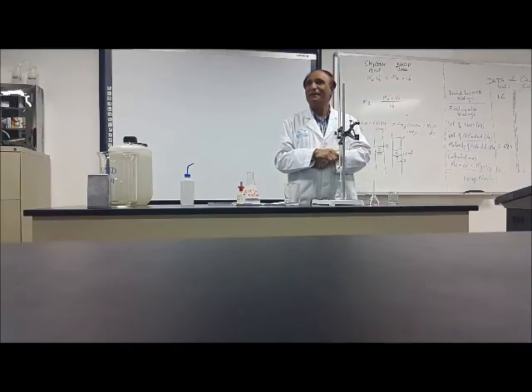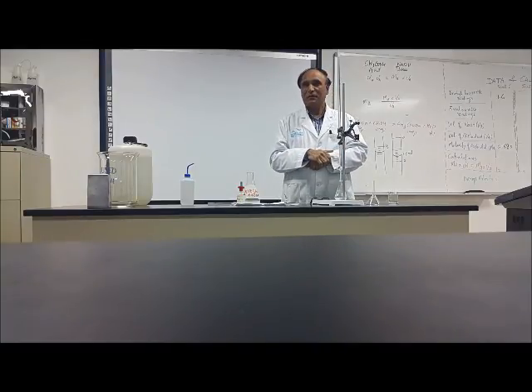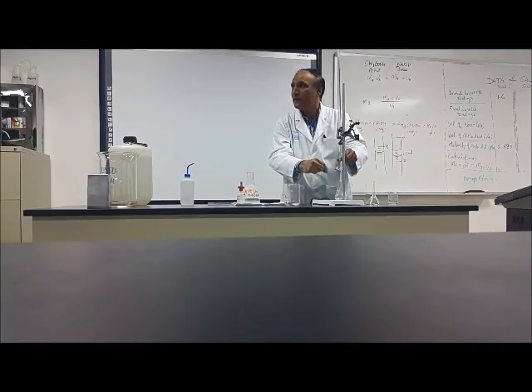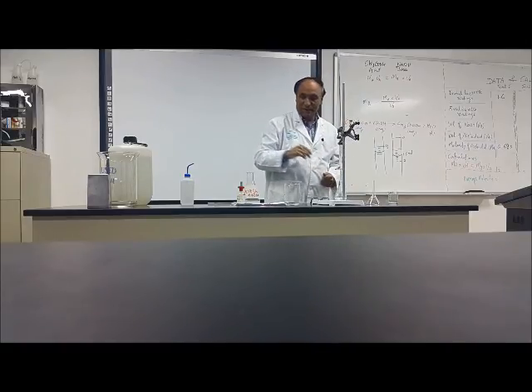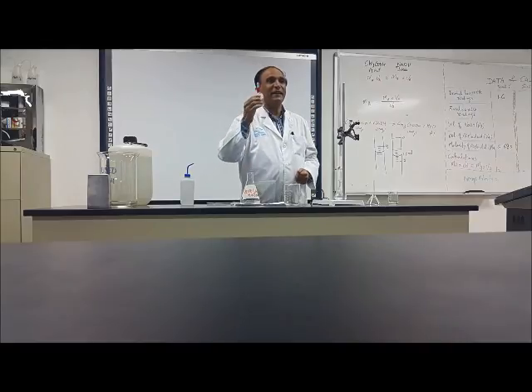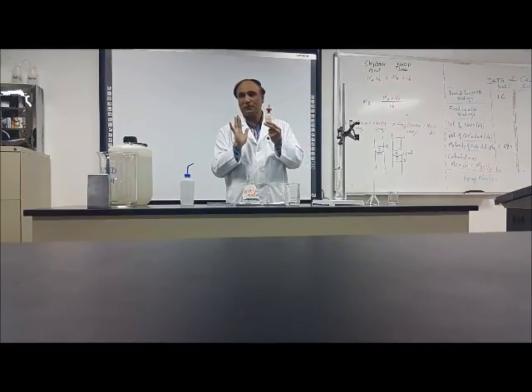Your partner? Your class? No, the doctor. When I put this, who will tell me, okay, don't put anything more? The indicator will tell me. This will tell me don't put anything more.